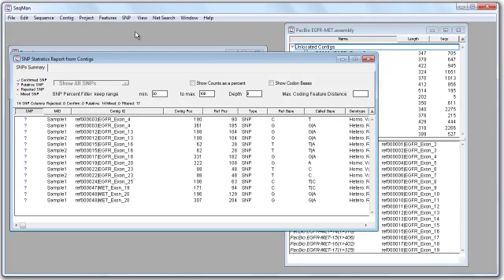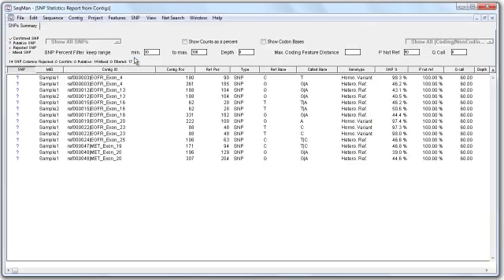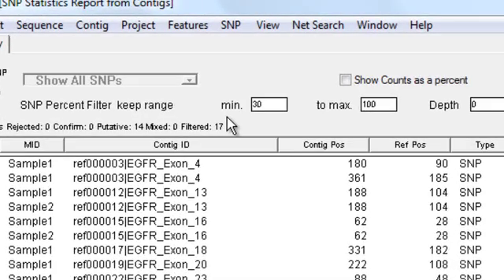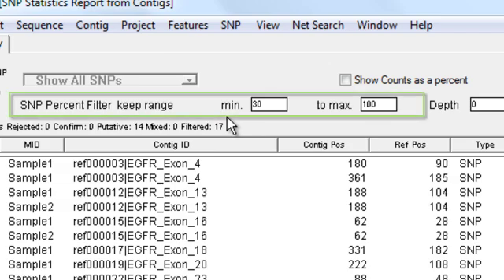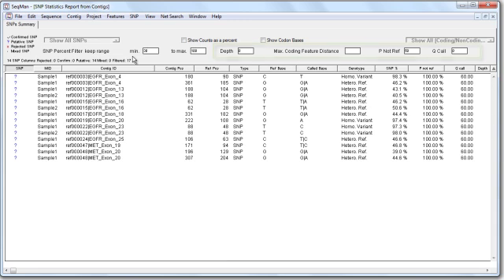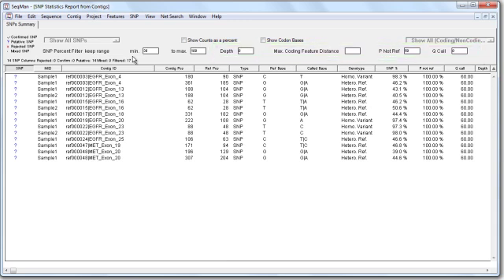Because this is a fairly deep assembly, I've already filtered my SNP report to only show SNPs that occur at a 30% frequency or higher. Depending on your data, you may also wish to use some of the other available filters to trim down your list.